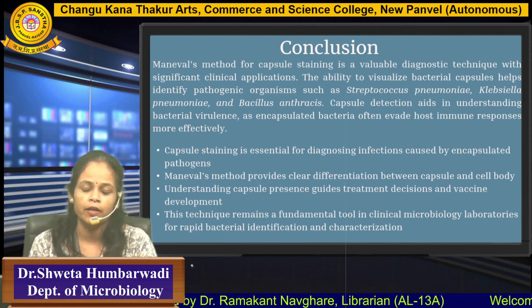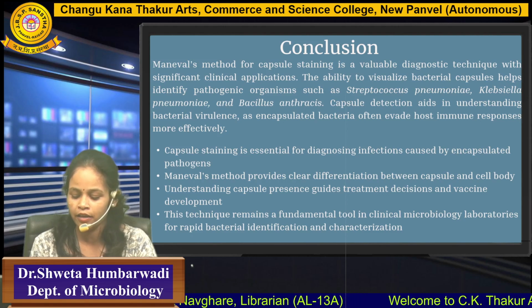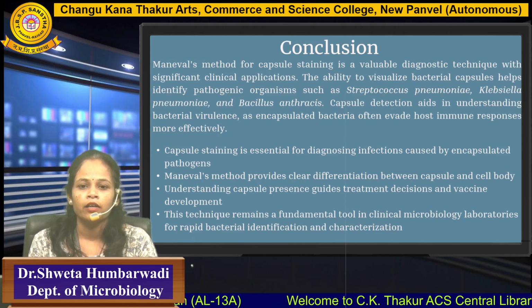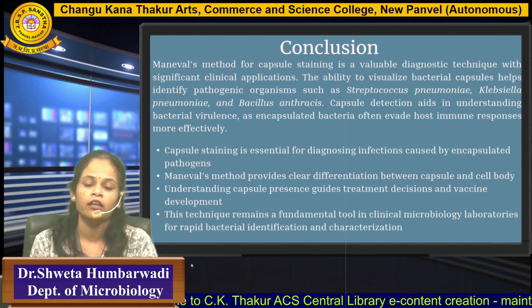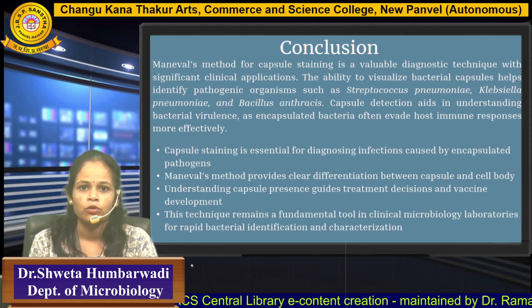This technique remains a fundamental tool in clinical microbiology laboratories for rapid bacterial identification and characterization. If the patient is suffering from different types of symptoms, then by observing the capsule over the organism, we can identify the type of organism present in that sample also.